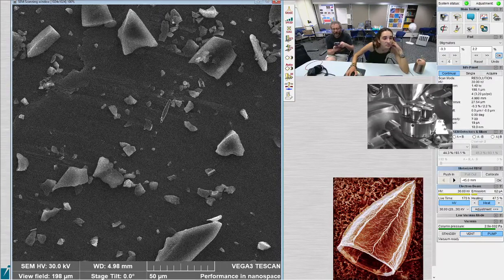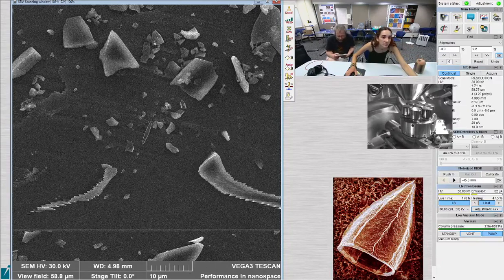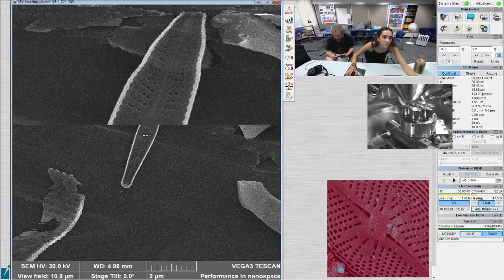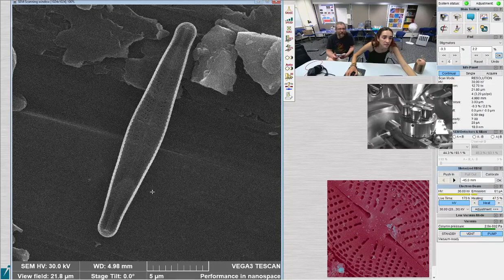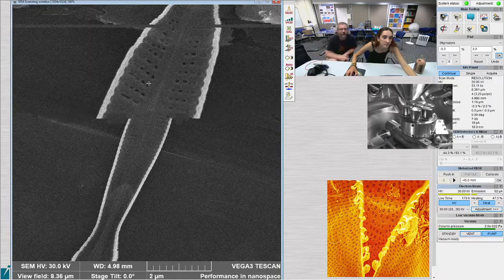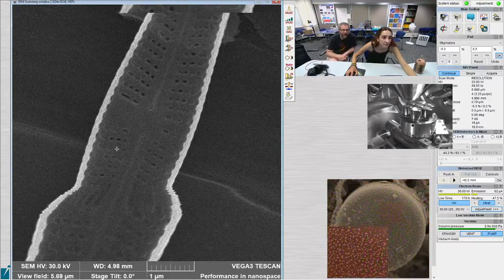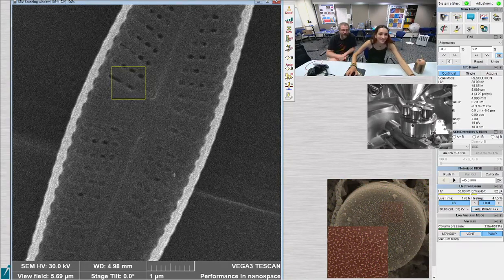Ooh. What'd you find? It's like a Rhoicosphenia or something, yeah. We saw that one before, but you should get it. I think we saw only the external view. Ooh, I think there's pore coverings and everything. Fancy.